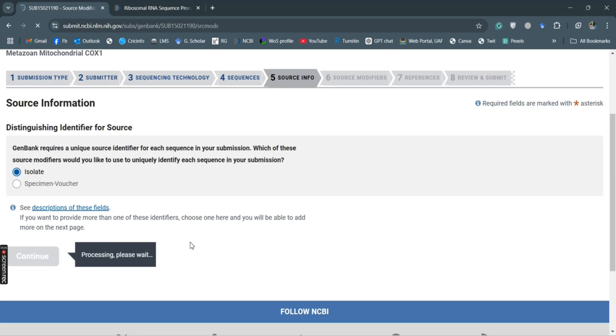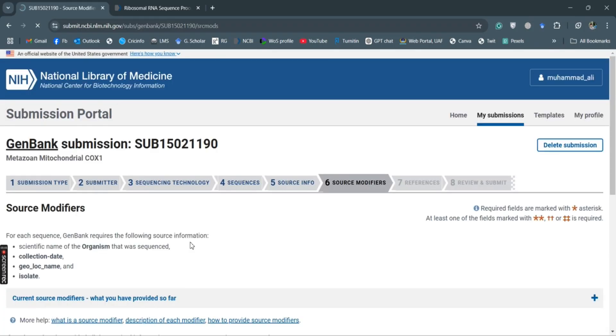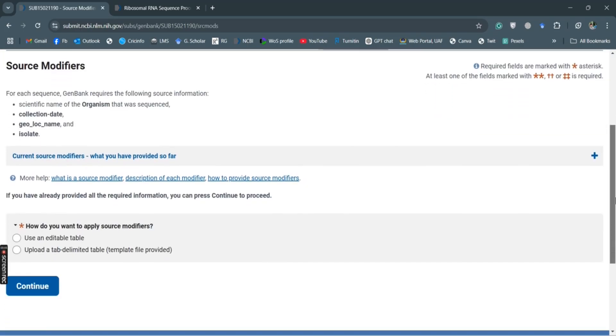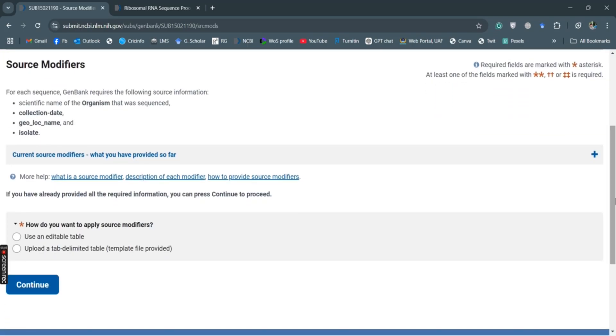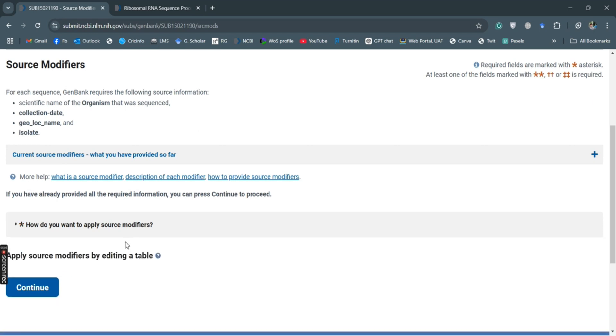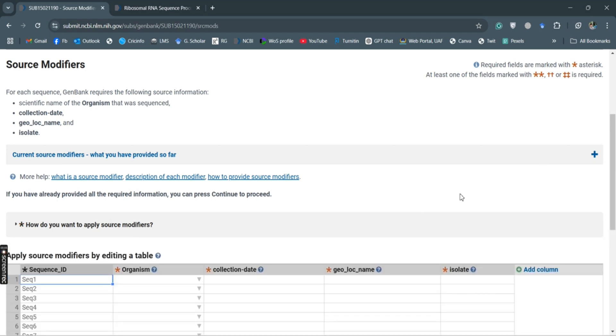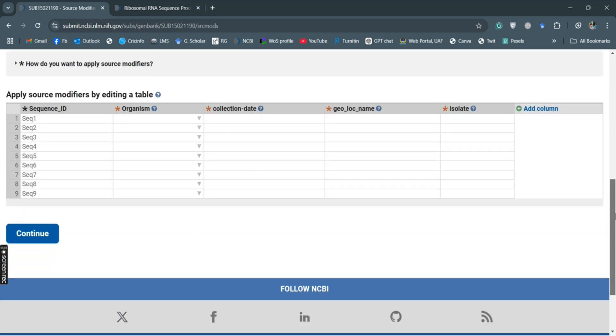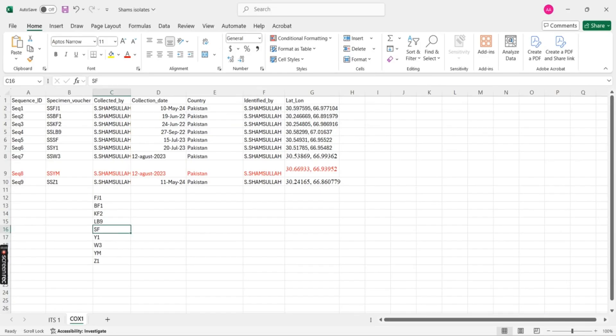And there we need source modifiers. It will ask whether you want to put this data in the form of tables or delimited type. So we use this table, and here there is organisms. We have this data for the organisms.